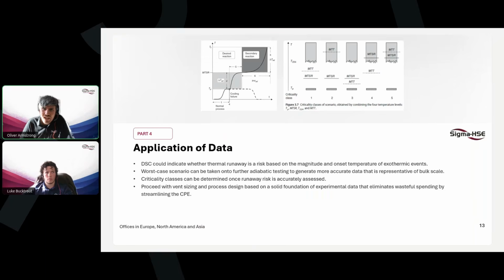And then unfortunately in this case, like we say, we may have seen in DSC testing a decomposition reaction at a higher temperature. So in this case, our MTSR overlaps with the exothermic onset of the decomposition, resulting in a secondary reaction and a runaway, which again has its own delta T adiabatic, and a TMR is also cited there that we discussed earlier regarding kinetic assessments and how quickly reactions run away from initiation.